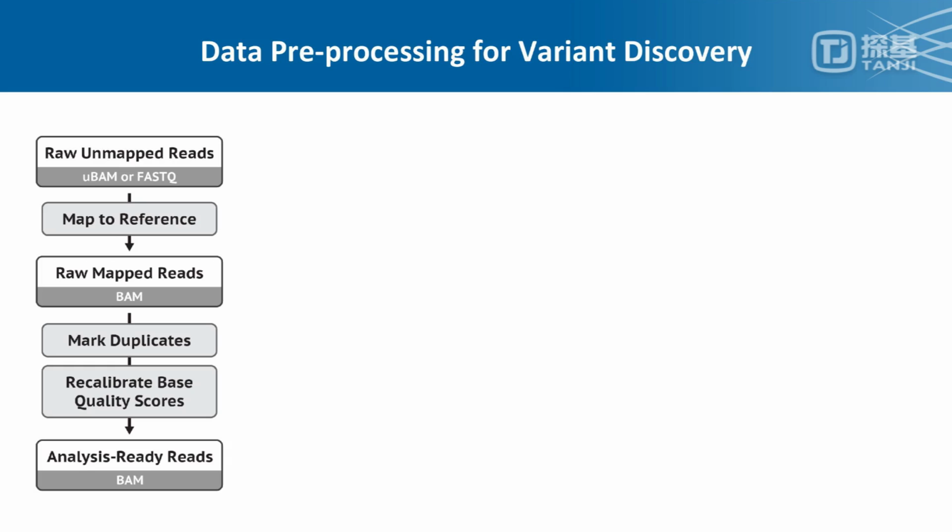You really don't know how to make sense of them. You don't know whether or not there are duplicates. And those quality scores, as we've heard, they tend to skew dependent on the machine and the preparation. So we know we need to recalibrate the quality.